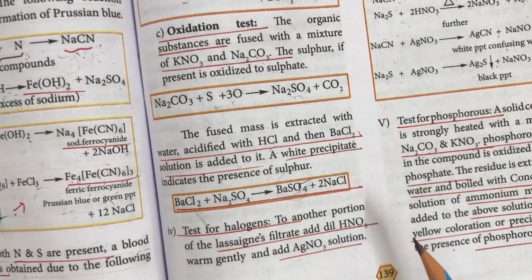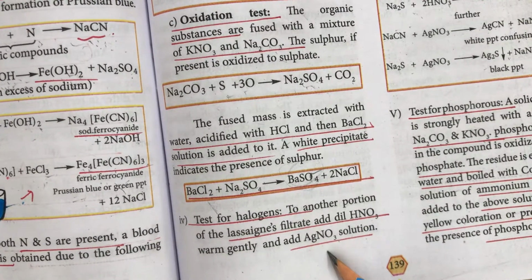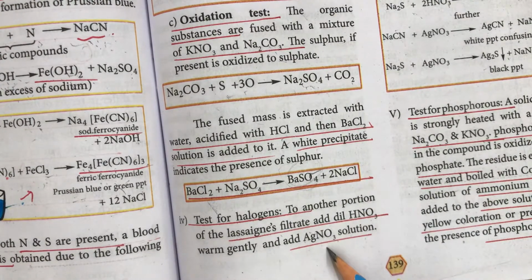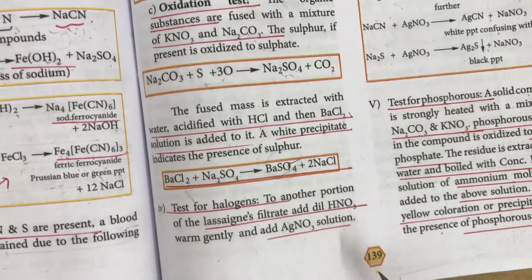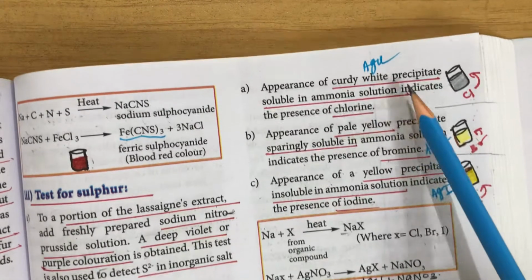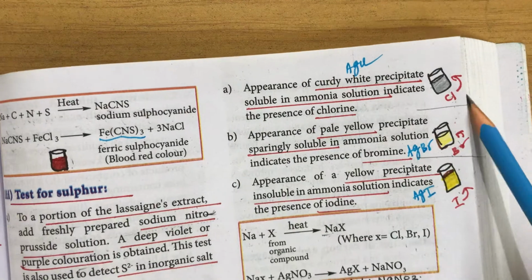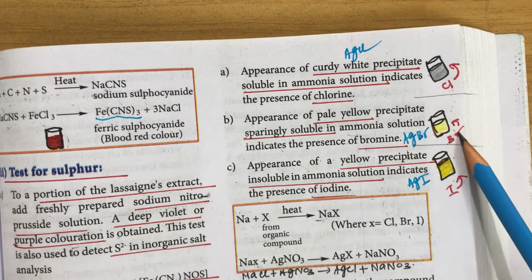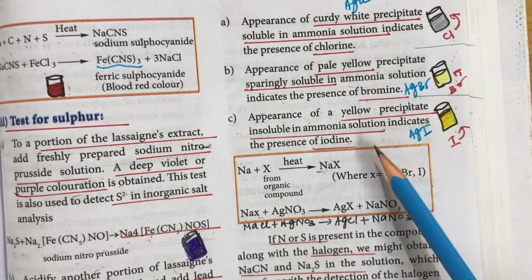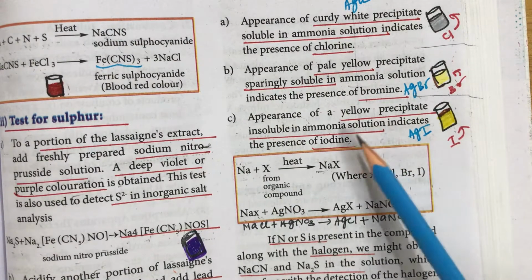That is the oxidation test. The next one is the test for halogen, the Lassaigne's test for identifying halogen. For that, the Lassaigne's filtrate is treated with dilute nitric acid and silver nitrate solution. If the organic compound contains the halogen chlorine, it forms a curdy white precipitate of silver chloride, showing the presence of chlorine. On the other hand, if it forms a pale yellow precipitate, it shows the presence of bromine. Otherwise, if it forms a yellow precipitate of silver iodide, it shows the presence of iodine.